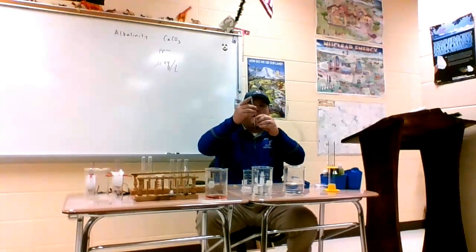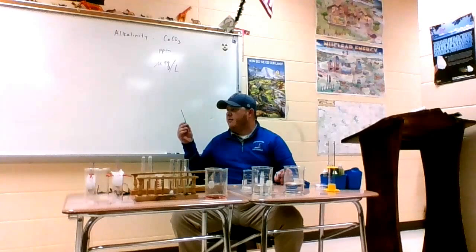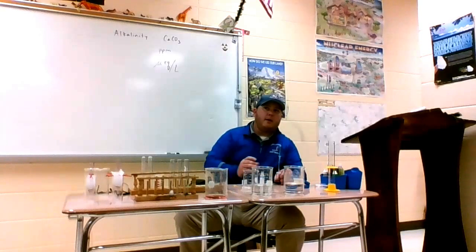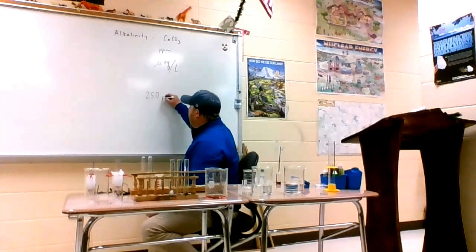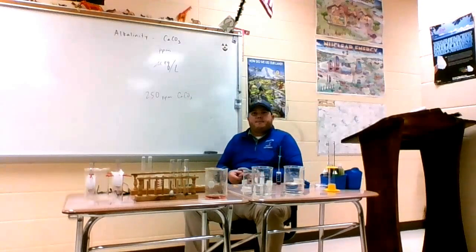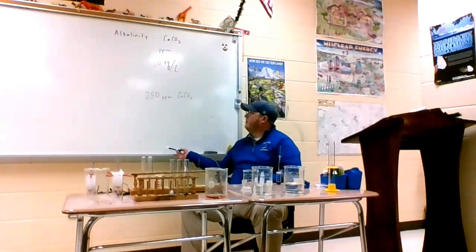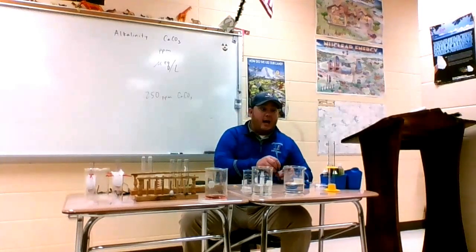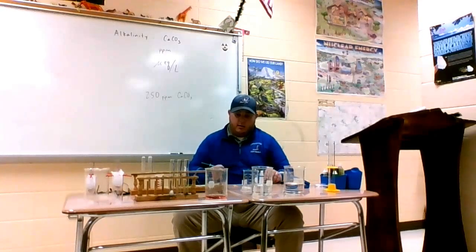So I read off my graduation here, and I'm at about 250. So that reports in parts per million of CaCO3. So we've got an alkalinity of 250 CaCO3. And we know that we have added alkalinity. We saw them add alkalinity at the water treatment plant. And they do that for a good reason.